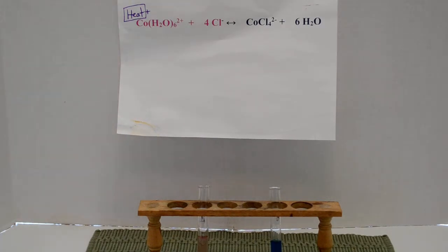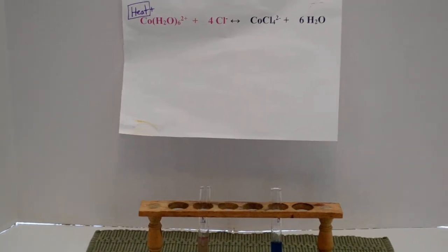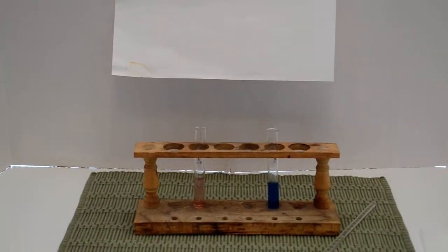Okay, next. Now I'm going to add water to this. Okay, assistant, bring me my water tube. This one?